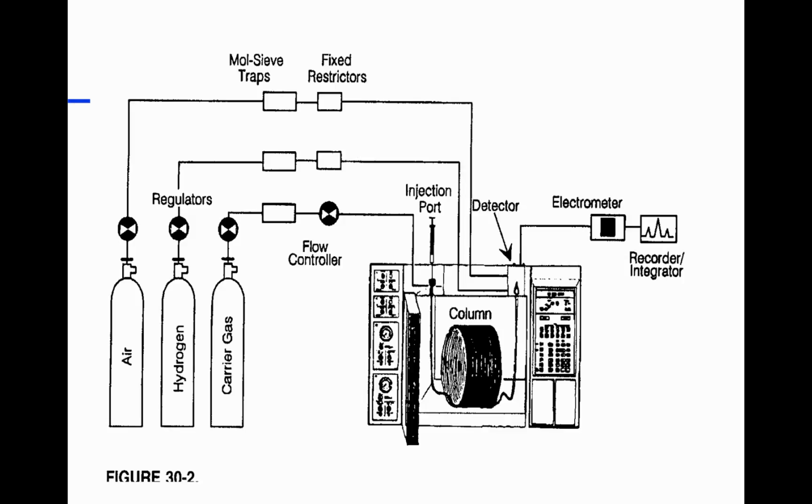We've got a little flame over here. That's a flame ionization detector. I'll spend time with it, don't worry. Our compounds come through here, go through our column, and they actually get burned in this flame. And it's kind of neat how it works. I'll give a hint: there's a 250 volt potential put right above here, a little collector ring at 250 volts, and this is grounded.